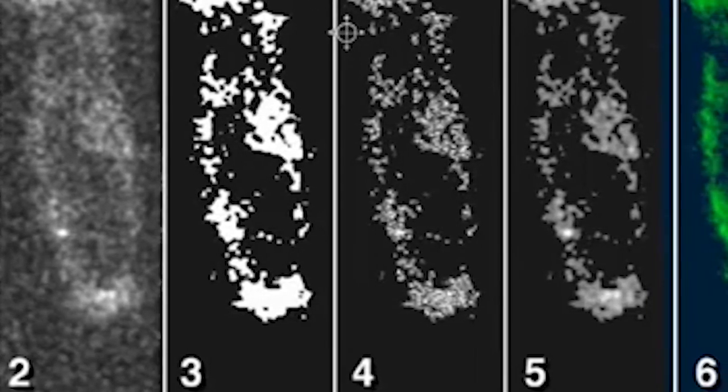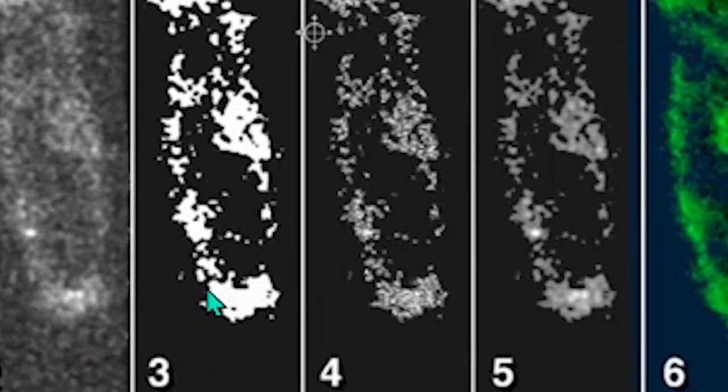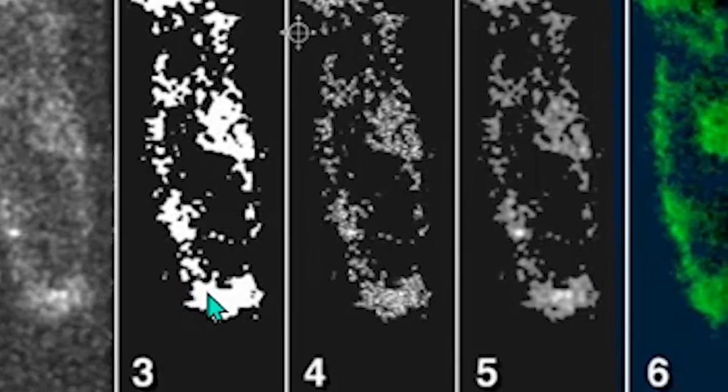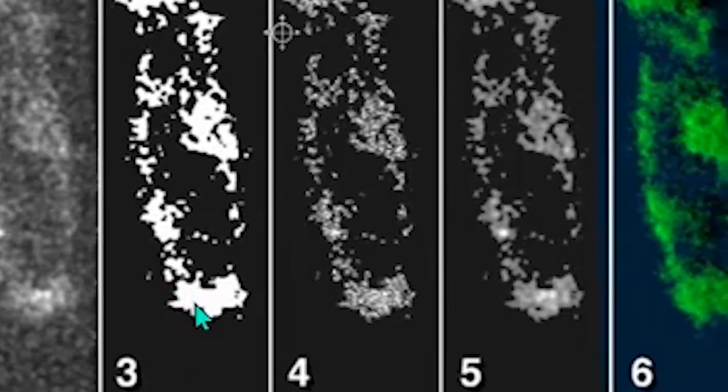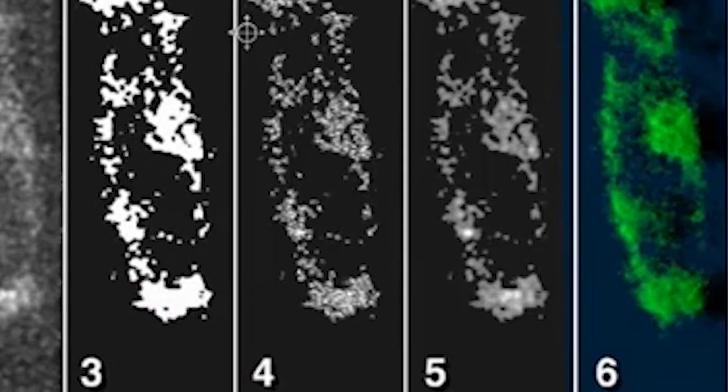We go through a process of making a mask and then extracting the data under the mask. If you look at box six you'll see I'm able to construct a really rather nice 3D model of what was previously a pretty poor quality image. So how do we do it?